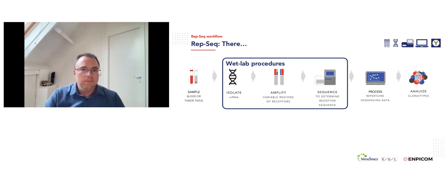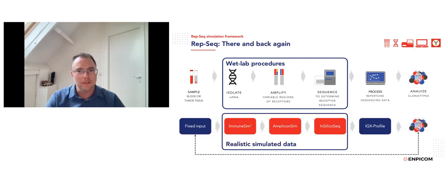So that was part of the journey that we had for developing the wet lab stuff. Of course, being a software company, being bioinformaticians, we also very much like to do simulations to be in full control of everything that happens. And for that, we also have been developing a realistic simulated data framework. The idea here is to have a fixed input so that we have a very good way of benchmarking our new tools and other tools, so that we can be certain that what we process is doing it exactly right.